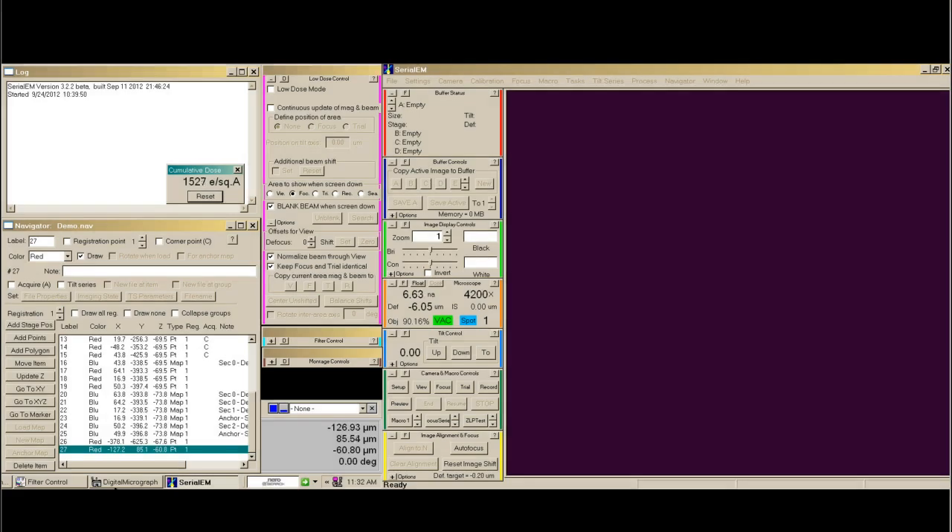We've gotten to 1,500 electrons of total dose, so now I can take myself to the imaging mag and find an area of interest on the cell. You can see the dose increases dramatically as we increase the mag.